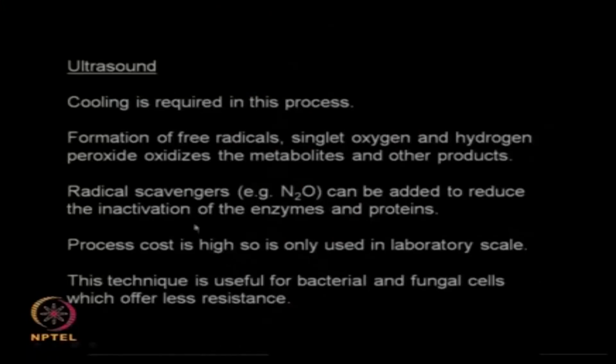So you need to add radical scavengers, for example N2O. By adding radical scavengers, the radicals that are generated by the ultrasound treatment can be captured, but then the problem is how do you remove the radical scavengers after you do your cell breakage. So that is an issue which you need to keep in mind.